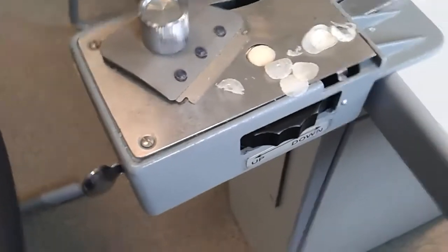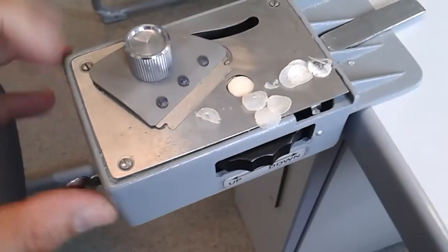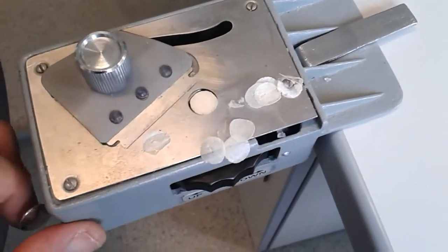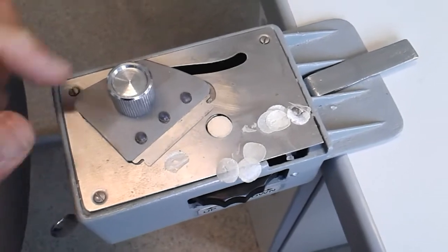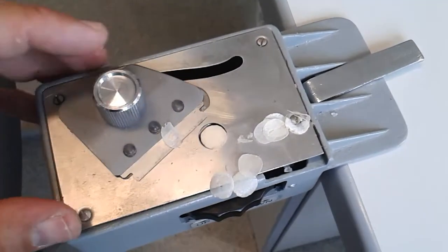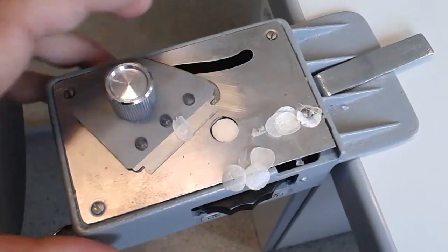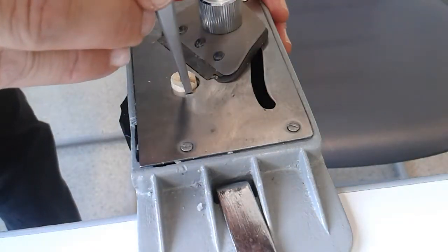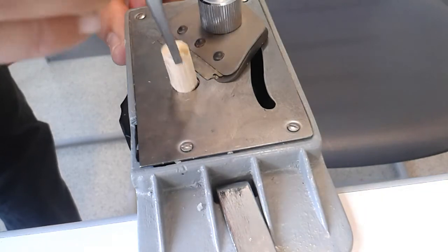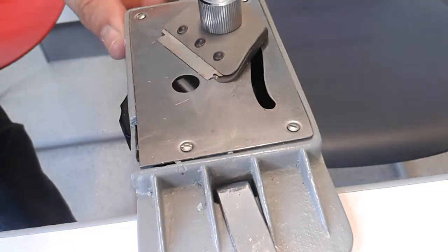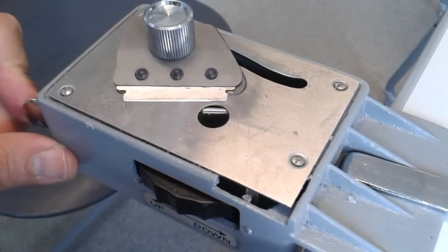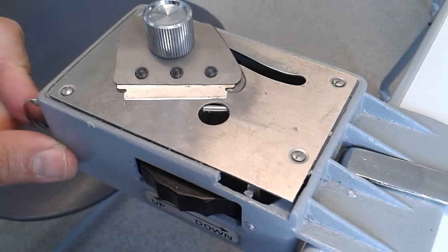In order to remove the specimen, I have to press this lever again here. This will open it up, but now I have a problem getting it out, so I might need some tweezers to actually get the elder pith out again. As you can see, pushing the lever will release the specimen.